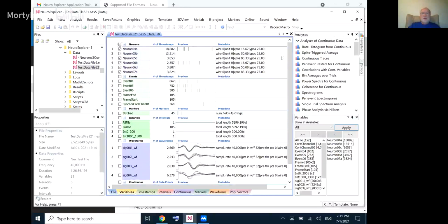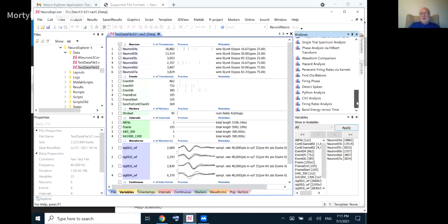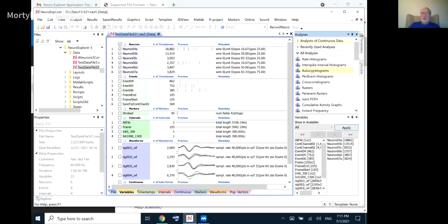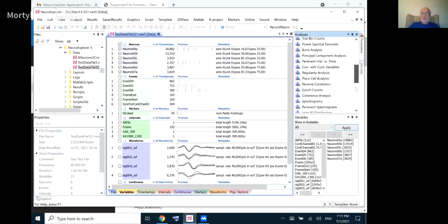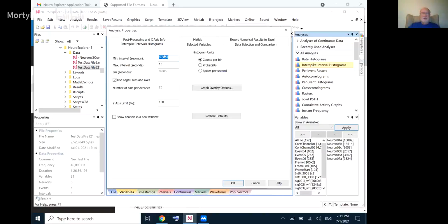So let's run our first analysis. The list of analyses is here in this upper right corner. The way they are sorted is, I would say, in a historical way. As I add analyses, I just add them to the bottom of this list. If you have analyses that you want to use more often, you can always reorder the way the analyses are shown here. For example, if you use this one more often, you can move it here. So let's do some simple analysis, for example, interspike interval histograms.